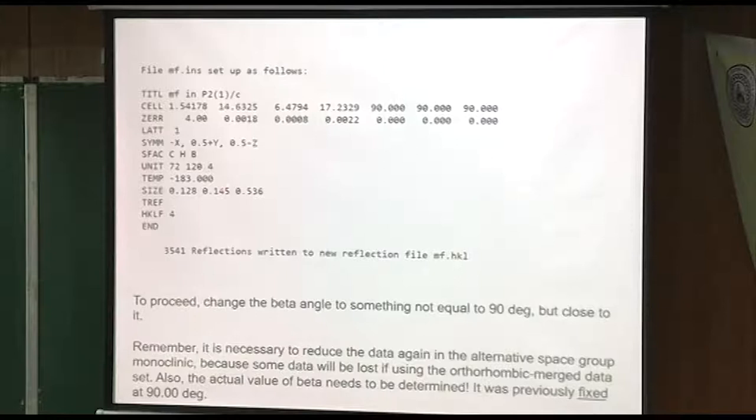I tried direct methods and it didn't work. Then I tried XT and it didn't work. The reason XT didn't work was that it was looking for an orthorhombic space group because these are all exactly 90. So I just changed that to 91, just arbitrarily. But I don't know what it really is until you go back. Start at the very beginning again, select a monoclinic setting.